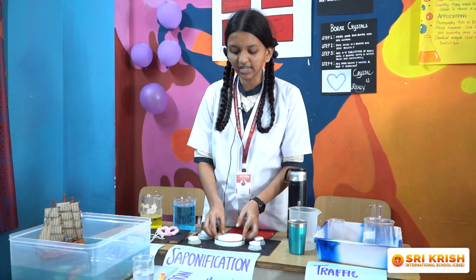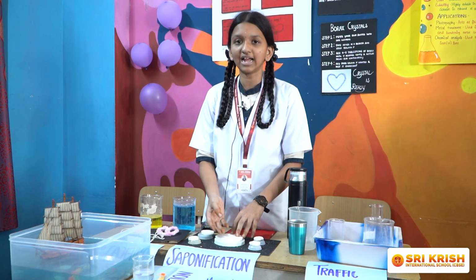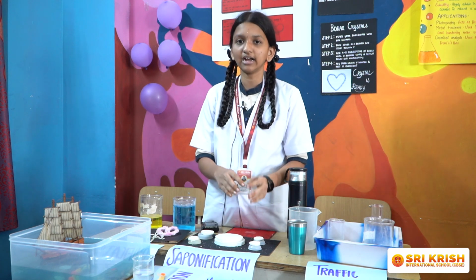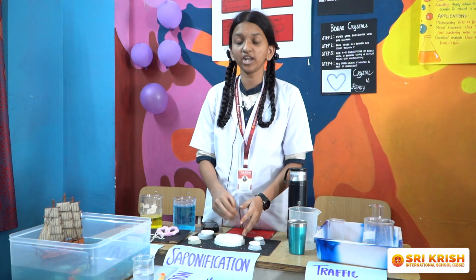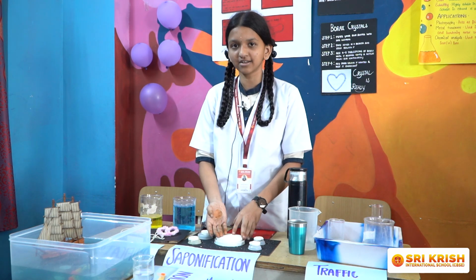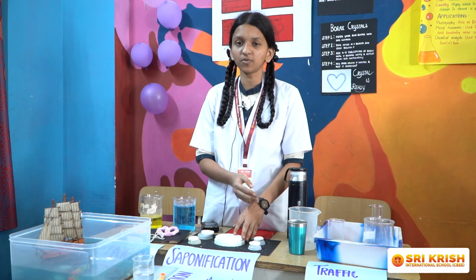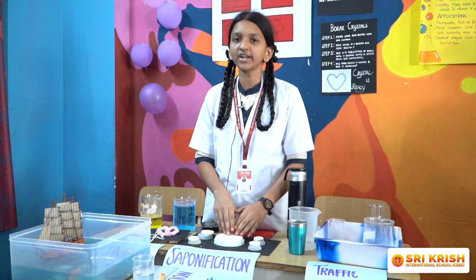Now let me tell you why we are using NaOH. NaOH is generally a strong alkali. This alkali helps in the preparation of soap. Here the fat molecules will be broken down into fatty acids and glycerol. Fatty acids will react with NaOH, which helps in the formation of soap, and we use coconut oil.